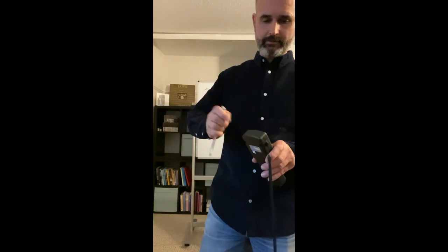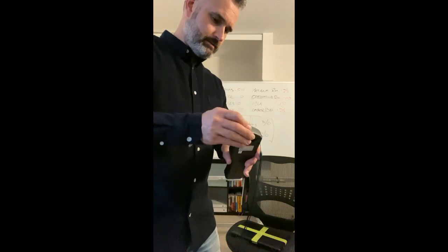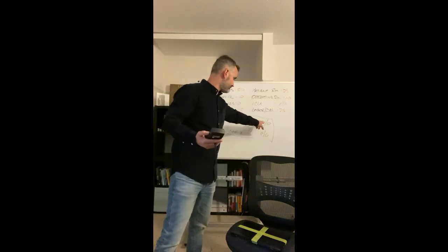Now, it may have had something to do with the bacteria that was on my hands, adding to it, I don't know. Oh, you know what, though, I did handle that boot, so perhaps that contributed. All right. So we drop that guy in. And we do the countdown. So we are on to the disinfect only section. So let's see what we get.